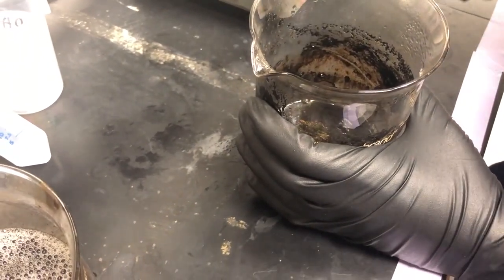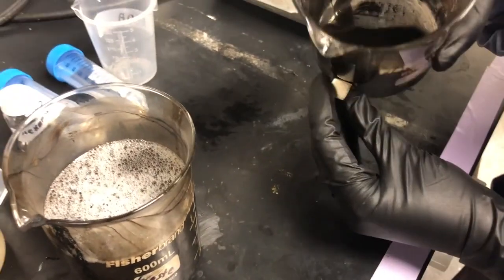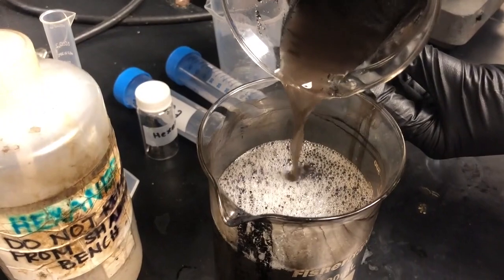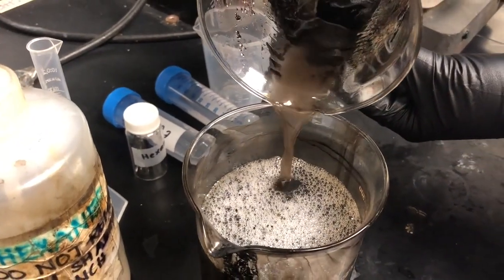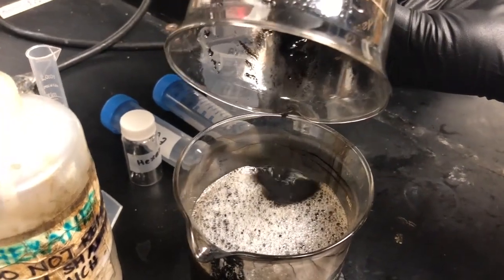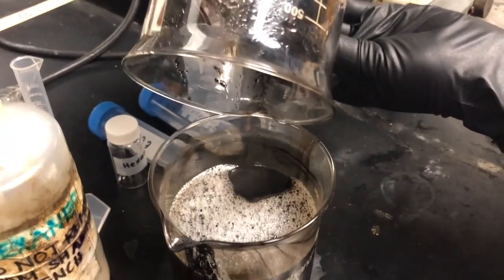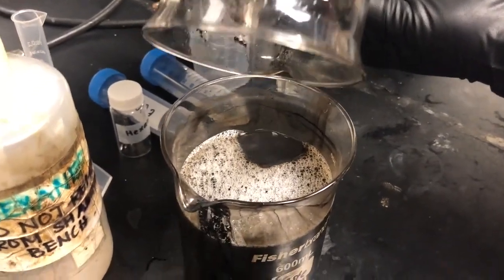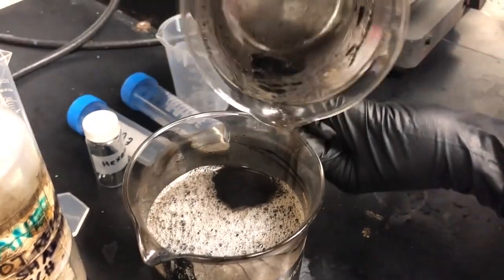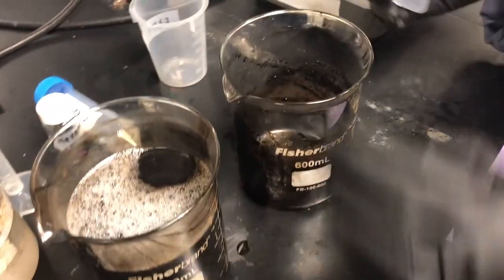All right, we're going to again put the magnet next to it, and we're going to extract it out. You should see much more of your particles be lost at this step. You can see the liquid's much darker. So you're going to have some of those students that are going to try to recover every single particle. But remind them that the particles that are coming out, they are not well coated in oleic acid and they're not very magnetic. So these particles in particular, we actually do want to remove. So this is a purification step, so quality over quantity.